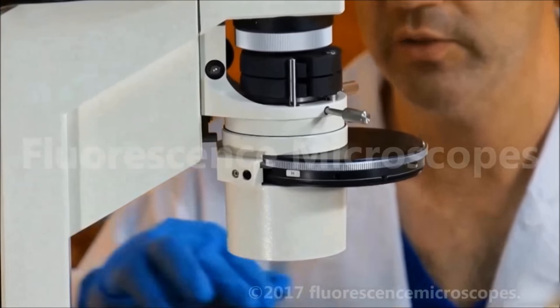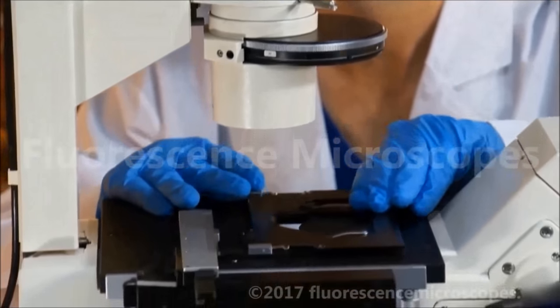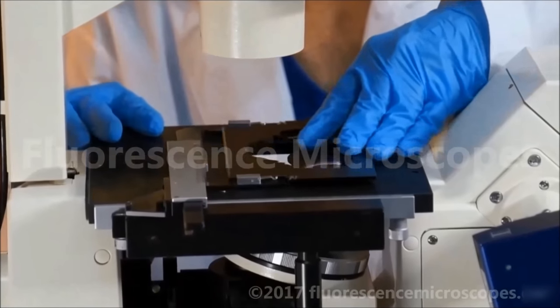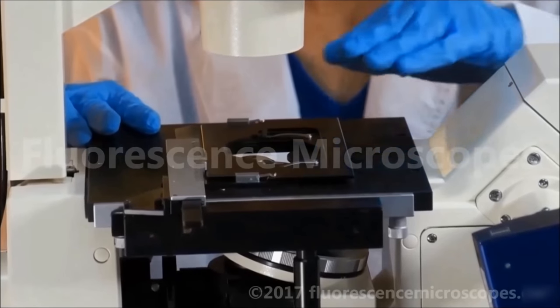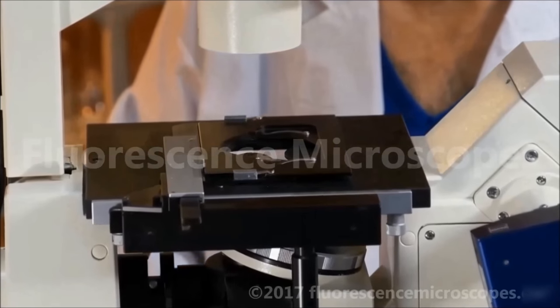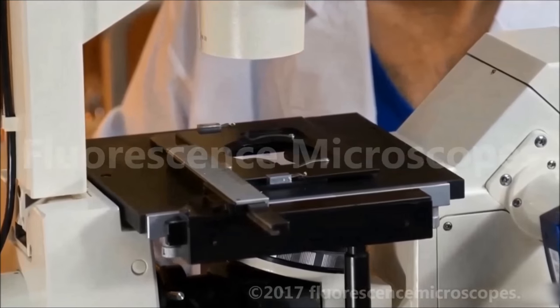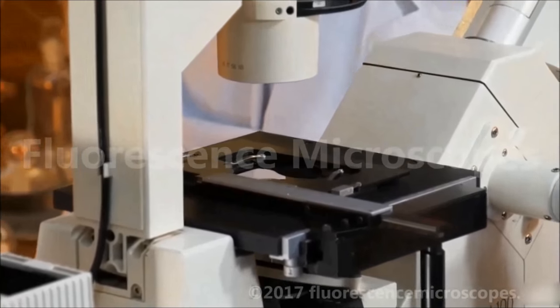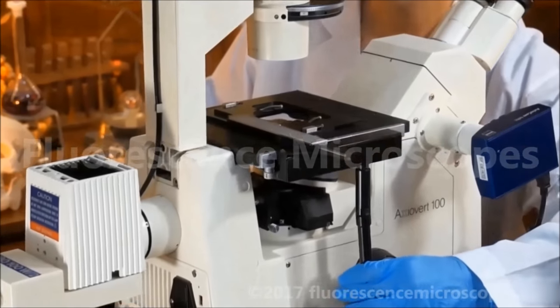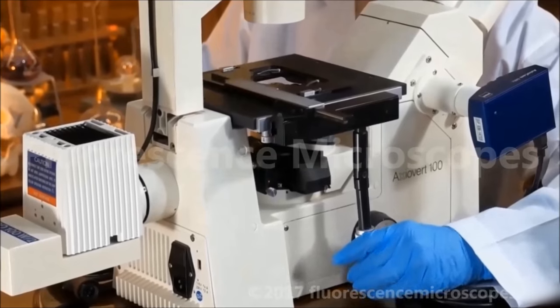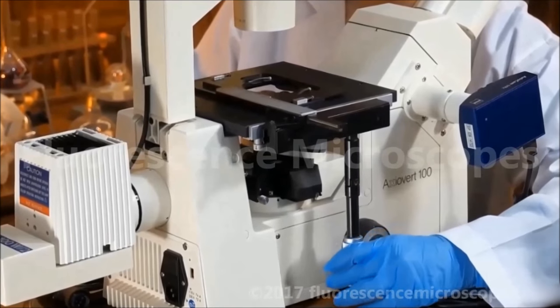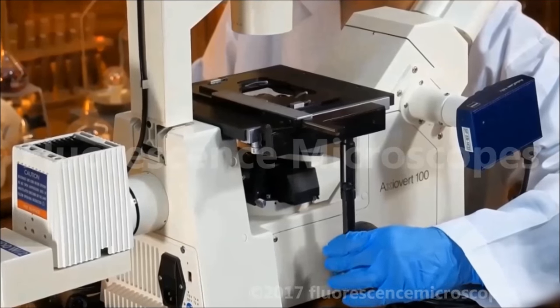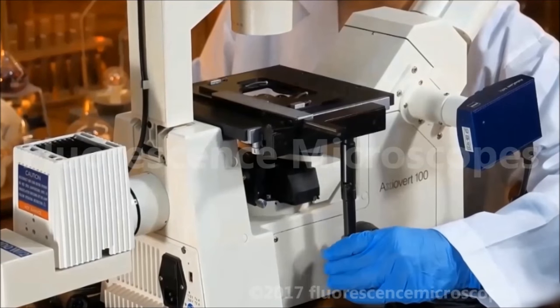We have a stage mounting plate included. You can get different stage mounting plates for these, depending on which size of petri dish or type of cell culture vessel you may have. This particular unit has an XY stage movement. So you don't just have to slide it around with your hands. You can use the low position XY movement to precisely position the specimen.